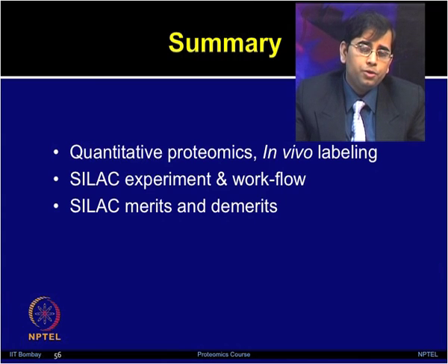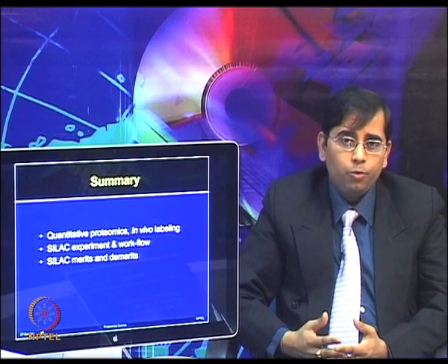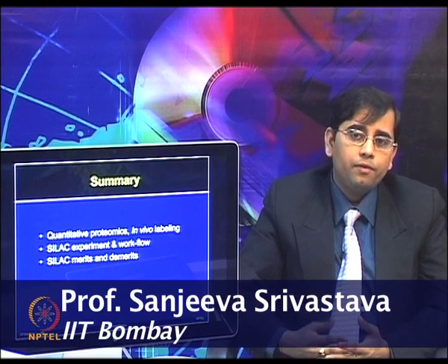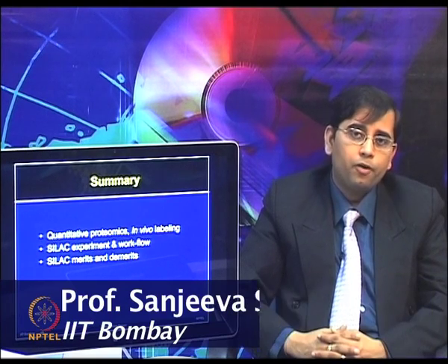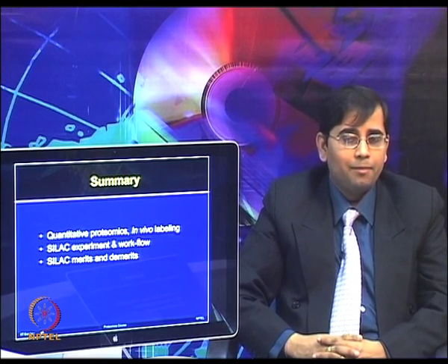The limitations include the use of only cell culture and the metabolic conversion of arginine to proline, but overall SILAC is a very promising technique and its applications are published in several papers. I hope by today's lecture you are able to appreciate different types of in vivo labeling methods, the SILAC experiment and the stepwise workflow of performing a SILAC experiment, and the merits and demerits of the SILAC method.